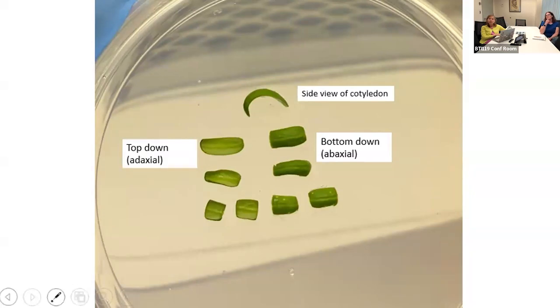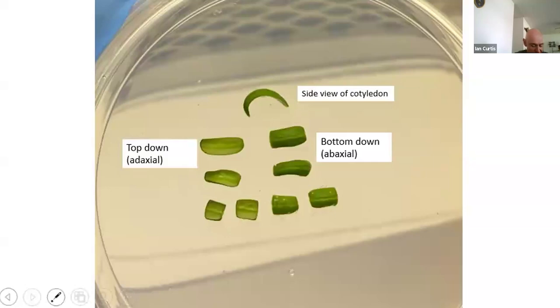So I have a question. I think I sent 4 questions in an email, but I'm just going to address one for the moment. Okay, sure. So going back, actually, you contributed to a book which I published in 2004 on tomato transformation. So in the early publications of tomato, people used feeder layers. I'm curious to know, do you still use feeder layers, or was there a reason why you moved out?